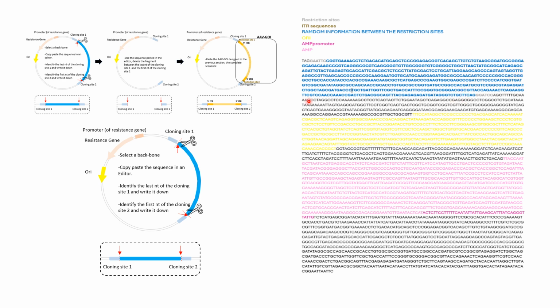This is the only thing that we have to do, and it's important to respect the end of the restriction site. Okay, it's important to keep the sequences intact. So we are going to cut from here to here. We are going to delete this region. That's the only thing that we are going to do. Okay, let's see how it will look like.